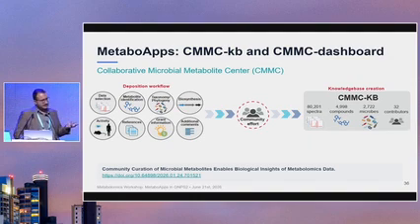So they selected their data with the metabolite identification. They've performed the taxonomy and phylogeny to provide the metadata for these samples. Also biosynthesis activity, gathered all the reference papers for that information. They also added grant information and other comments that they have on those samples.